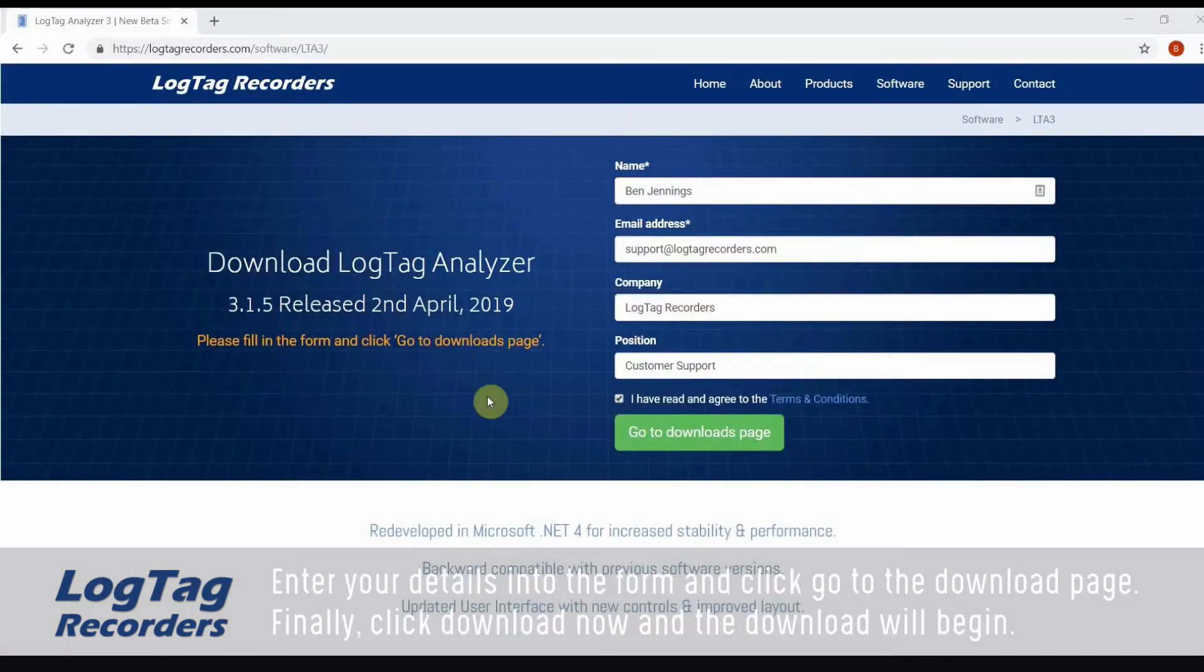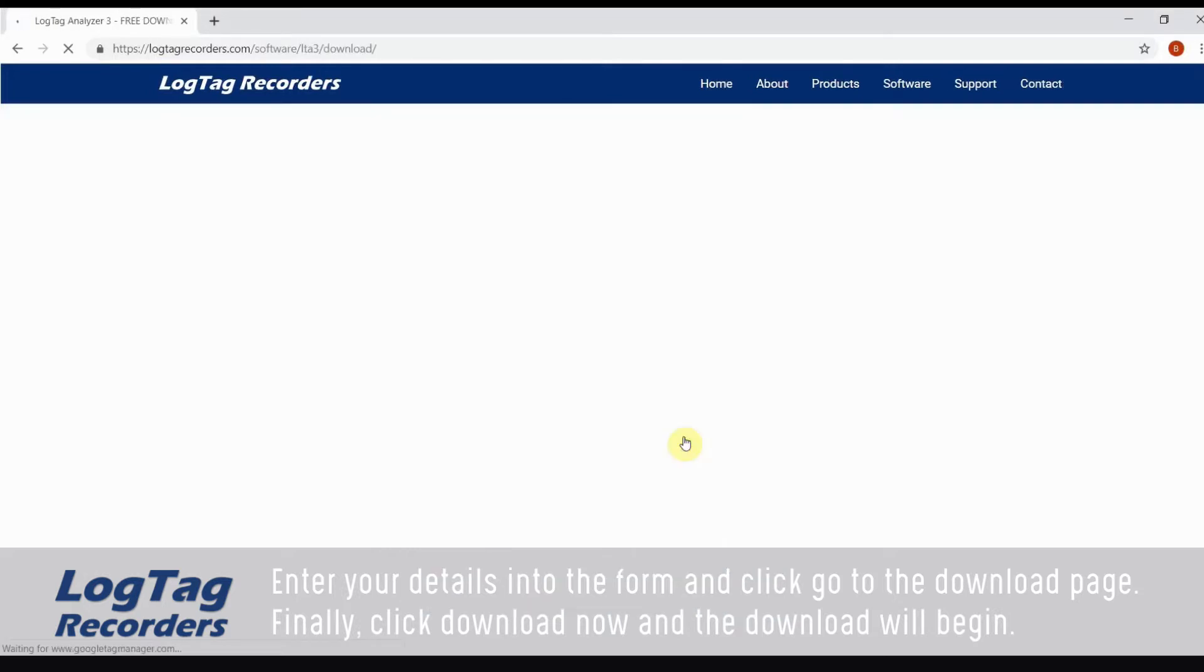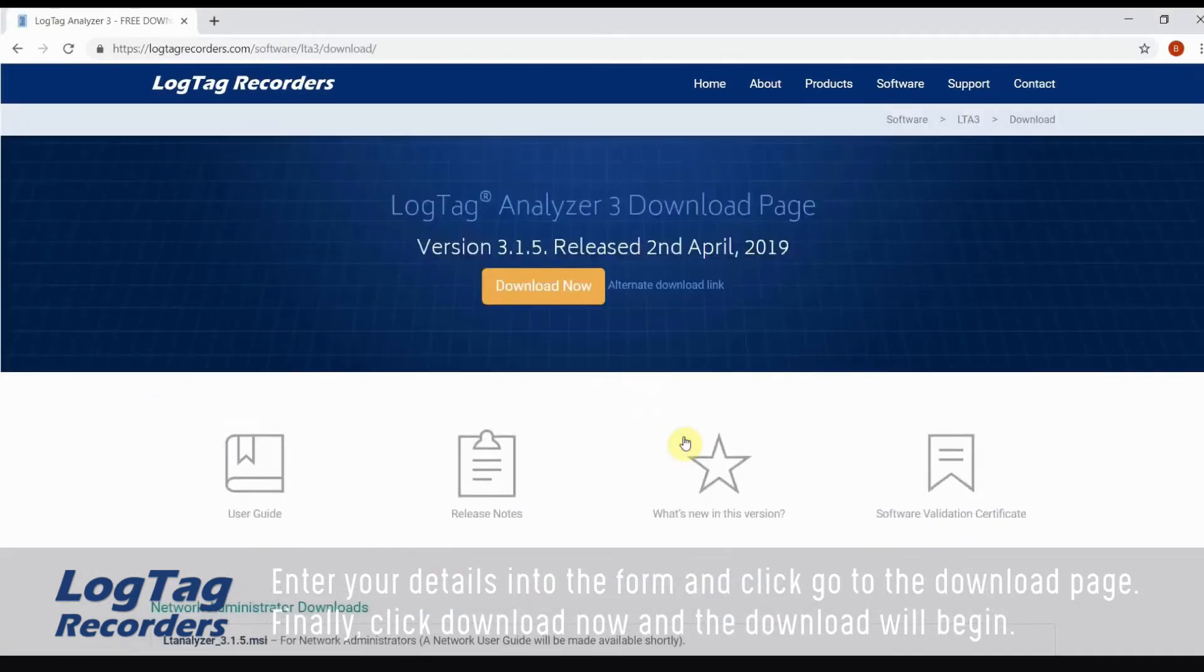Enter your details into the form and click go to the download page. Finally, click download now and the download will begin.